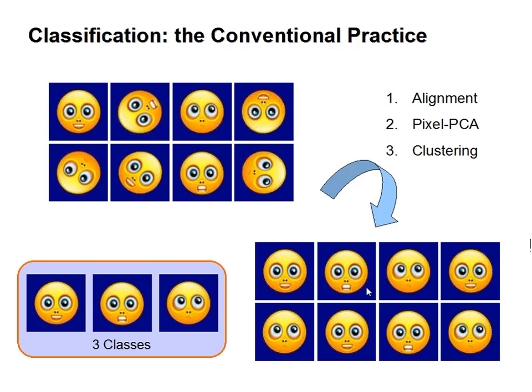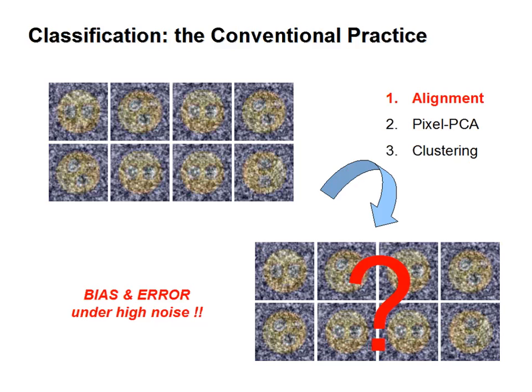However, in real cryo-EM data, there's a significant amount of noise. The signal-to-noise ratio is often below 5%. The question is, how can we be certain that alignment is reliable? The answer is no, we don't know. Of course, there have been techniques like self-alignment without requiring any user-defined reference, basically by summing the image stack and then aligning images to that image sum.